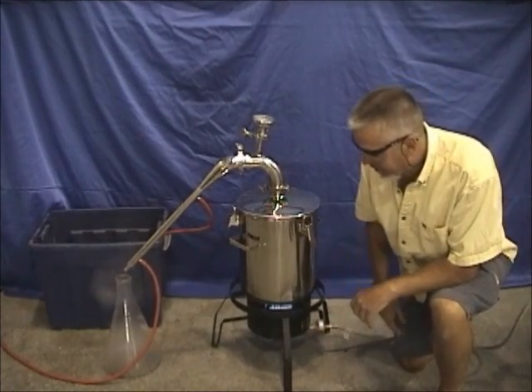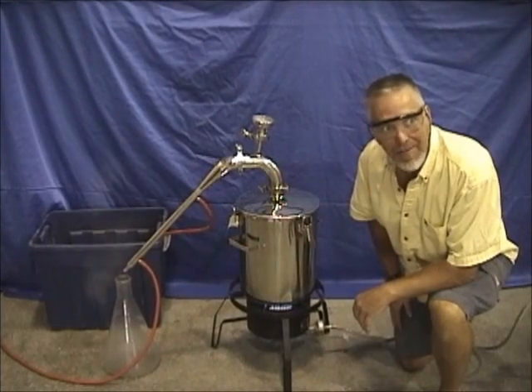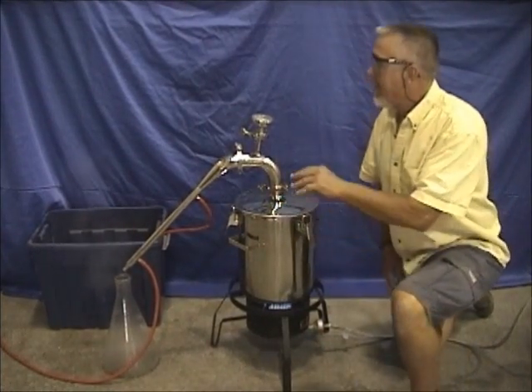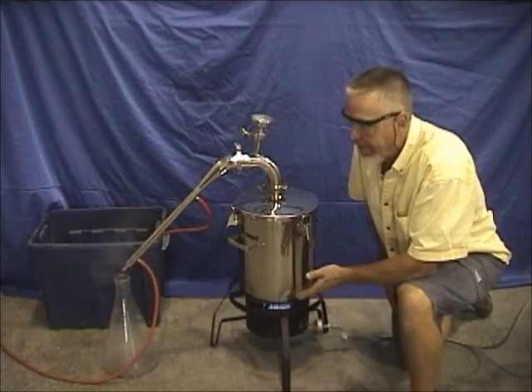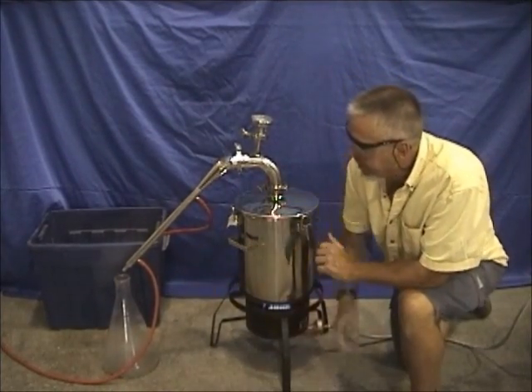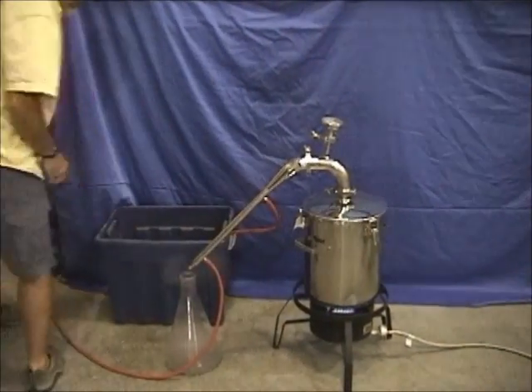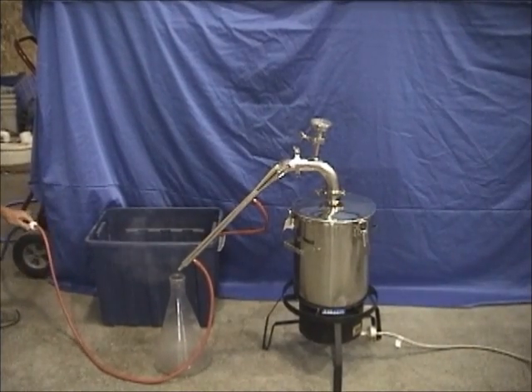We had to move down to the floor — the burner is so heavy-duty it was about to burn a hole in the plastic table, so we had a major transition to the floor. The temperature has gone up and we now have a boil. The steam is going up through the lavender and condensing back, and we're catching it in the Erlenmeyer flask.